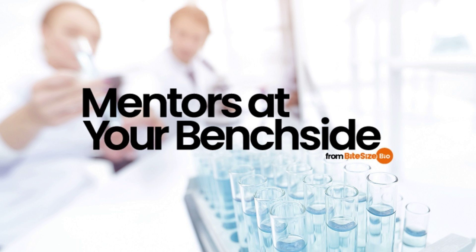But just when you thought it all made sense, a word of warning. Since the OD of a sample is dependent on the size and shape of the particles in it, different cell lines can have completely different relationships between OD and cells per mil. This means that a separate calibration will be needed for each cell type you use, which is tedious, but better than recording meaningless and arbitrary numbers in your lab book.